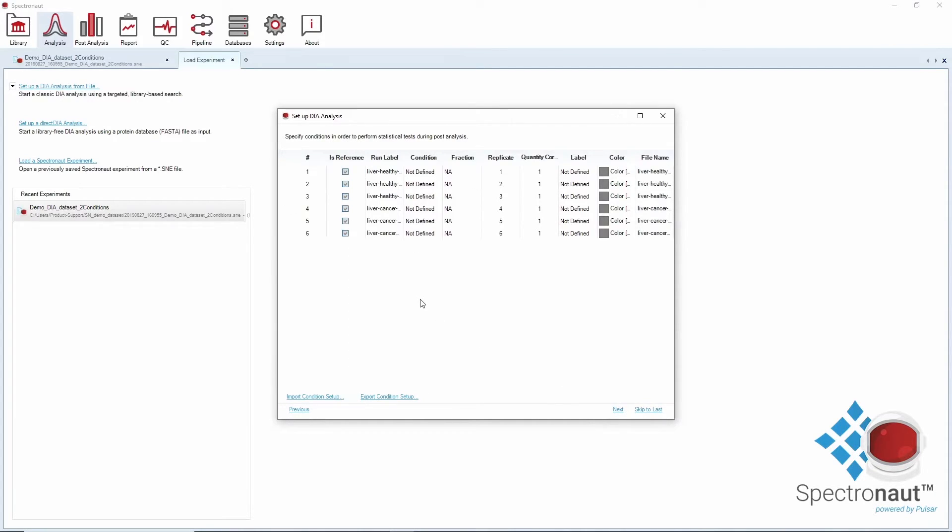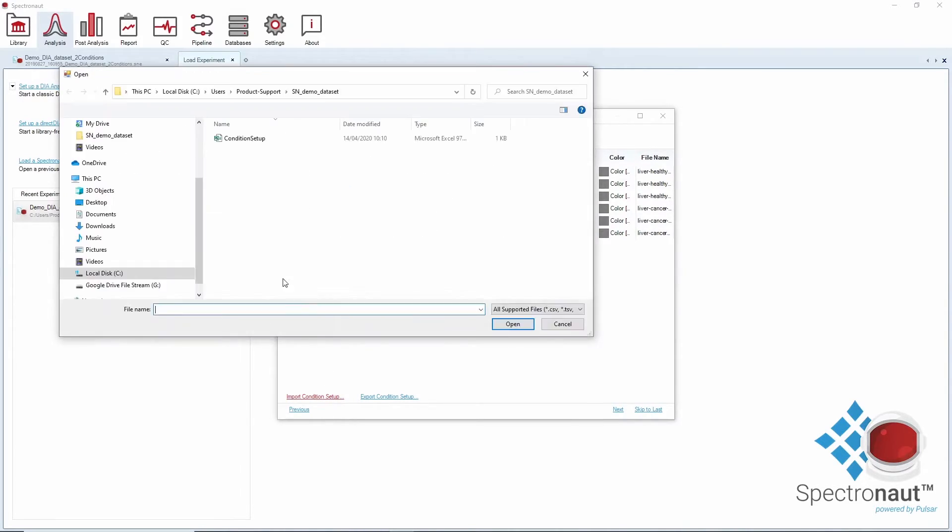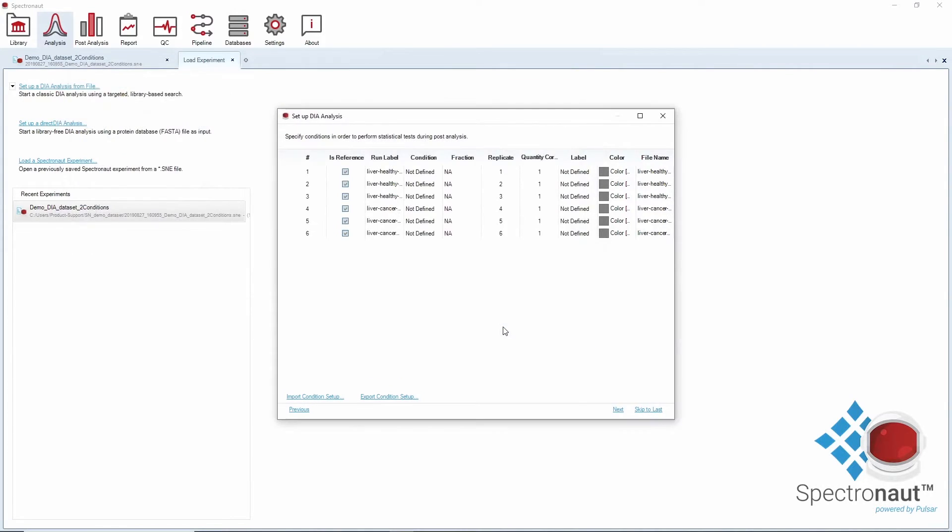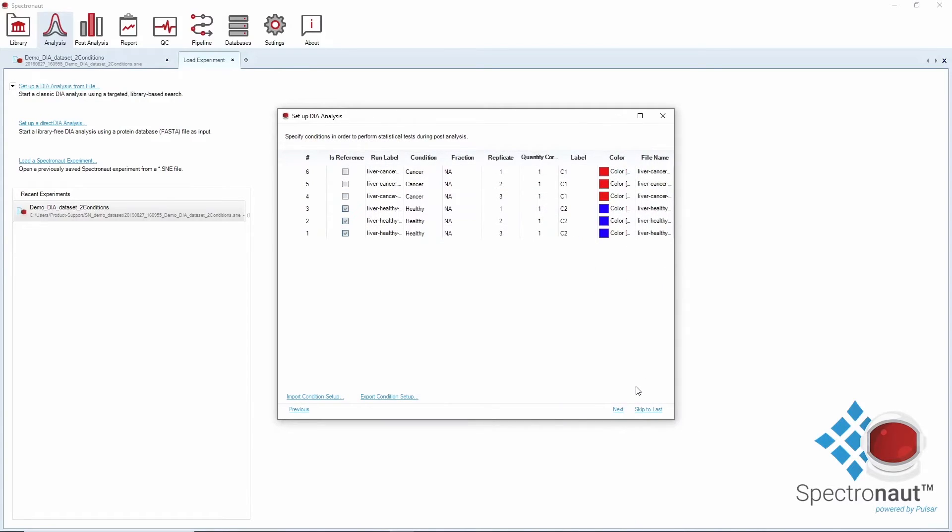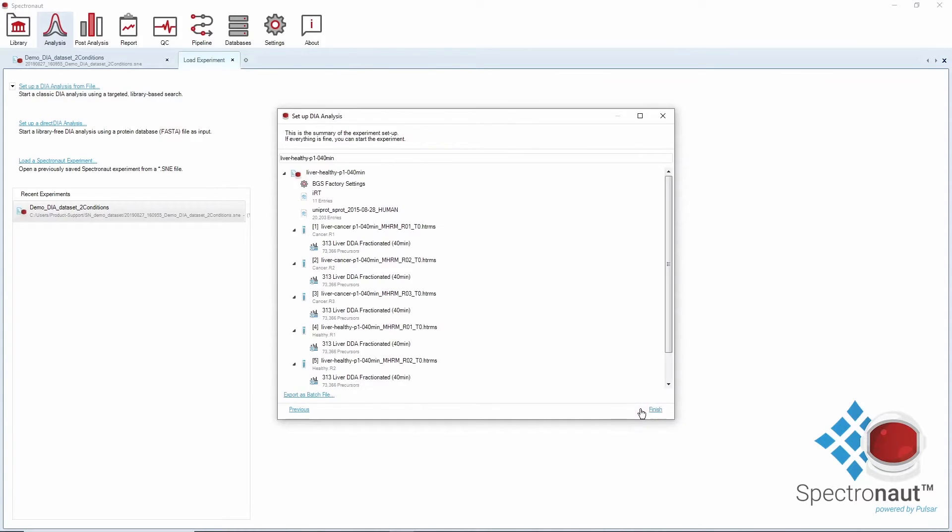You will then define your experimental conditions for post-analysis. If you already have a file for conditions set up, you can import it. By clicking on finish, you will start the analysis.